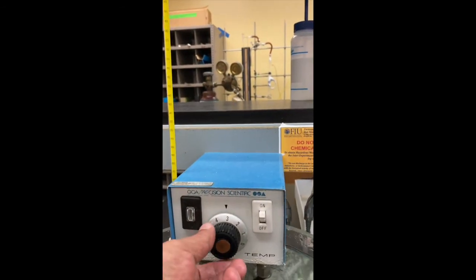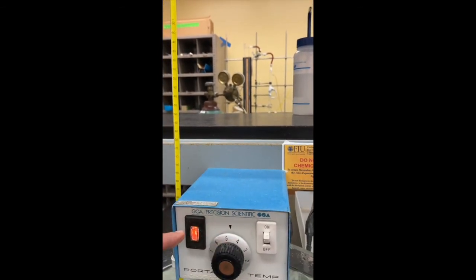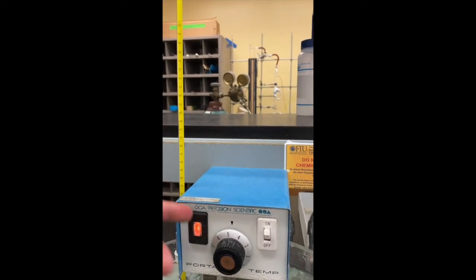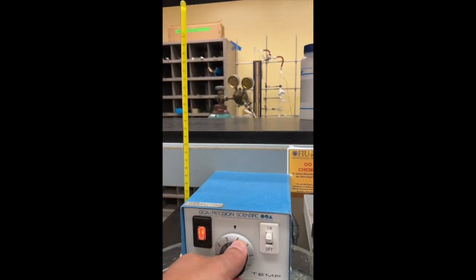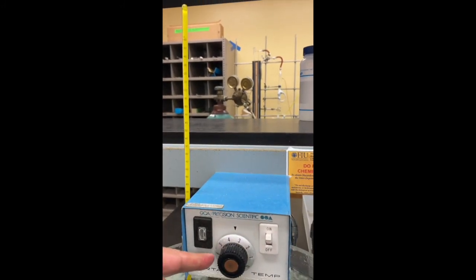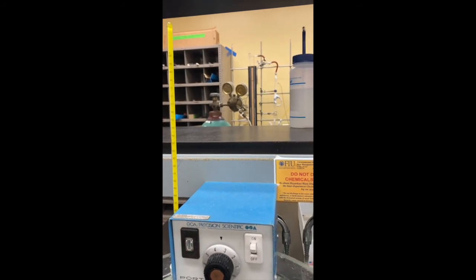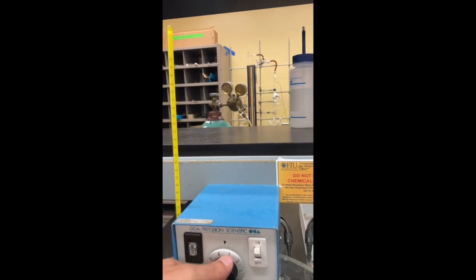So, how do we control the temperature? You can see if we adjust this knob, the light goes on, which means heating continues. Heating is switched on. But if you adjust the knob, you can switch off the heating, and in such a way you can adjust the temperature. Of course, if you overheat this water bath by too much, you can bring some ice from the stockroom and put some ice in to reduce the temperature.